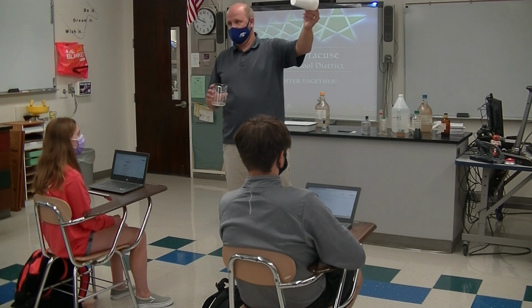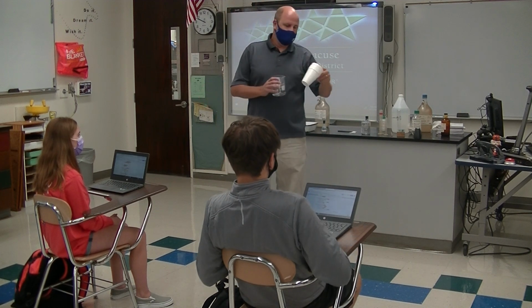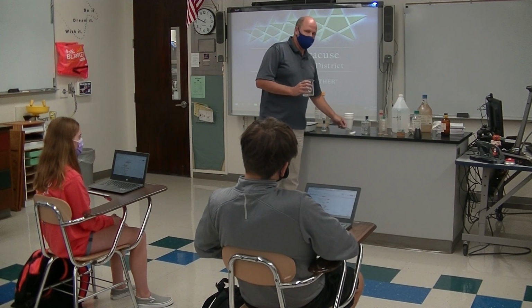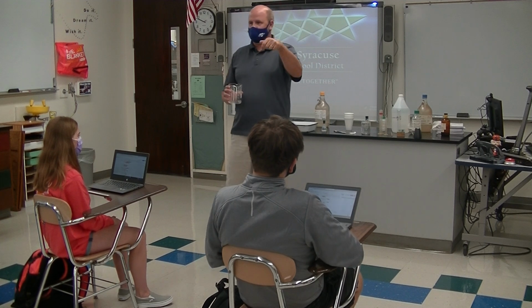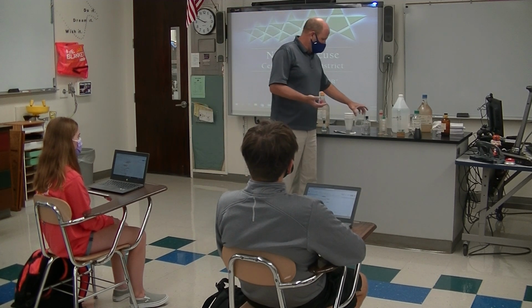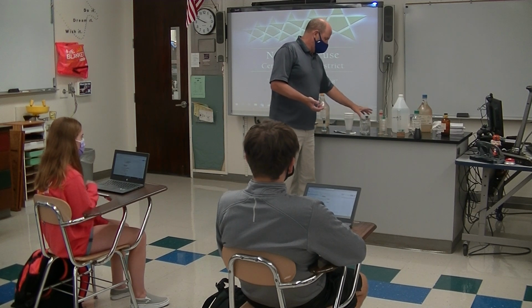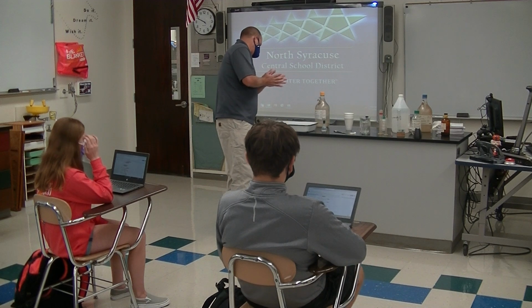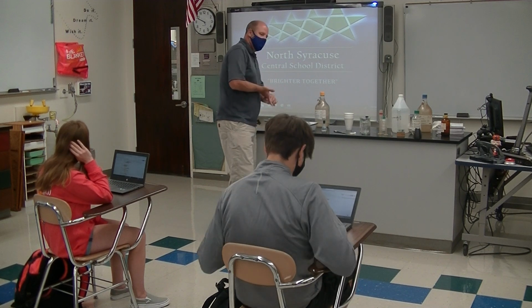It'll do the same thing. Gasoline is what they used to make napalm. If you guys have ever heard of napalm, they make those sticky substances that would catch on fire. They throw it at things and then light it on fire so it would stick. So don't put gasoline in the styrofoam containers at home. Just be careful with what you're doing in there. So organic solvents must contain carbon to dissolve many materials, so be careful.